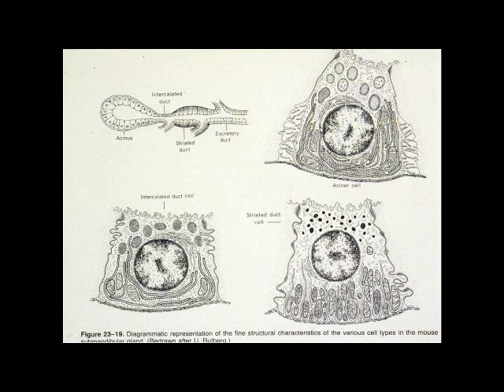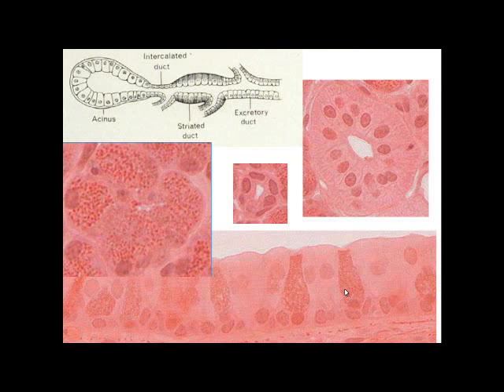So in the secretory portion, especially the serous, which has proteinaceous granules through here that are discharged, there is a lot of rough endoplasmic reticulum for protein production. Intercalated duct has less so, and then the striated duct is unique, and it's striated because the mitochondria are lined up, and they're lined up because the plasma membrane has increased its surface area by actually projecting into the bottom of the cell. So this is a striated duct.